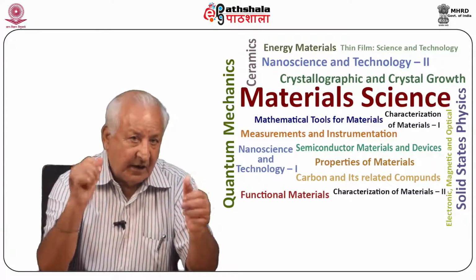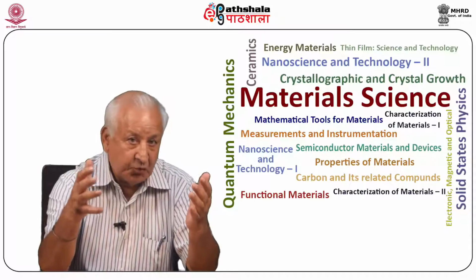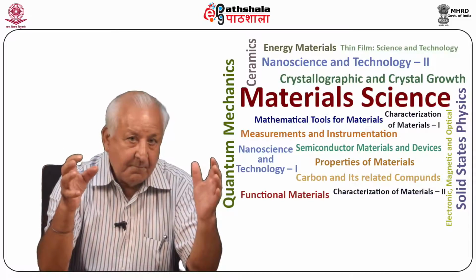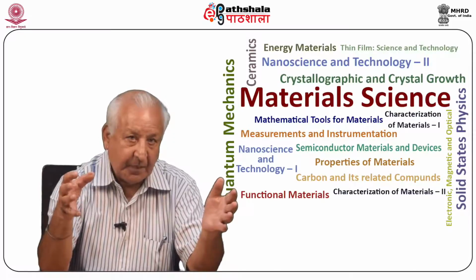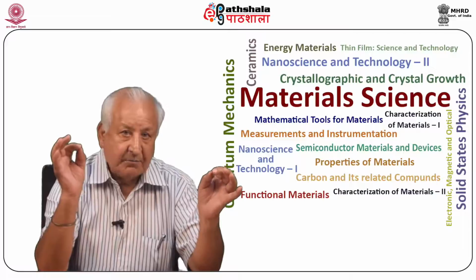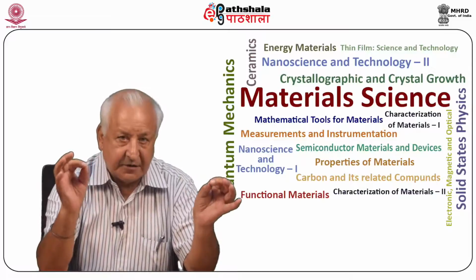In 1931, Berg gave an idea about a method wherein X-rays could be used as probes for the study of imperfections in crystals. Barrett further developed the method in 1945. X-ray topography requires point-to-point correlation between the X-ray intensity in the topograph and the crystalline perfection in the crystal.